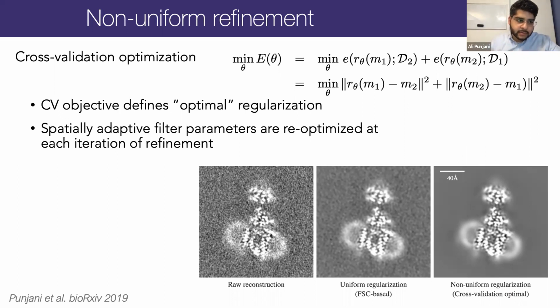So in general, you can try doing masking of micelles, but it's unlikely you'll get very good results, especially in a case where the micelle is actually causing a problem because the density of the micelle will be so high, and when you ignore it, it's going to totally change what happens in the alignments.